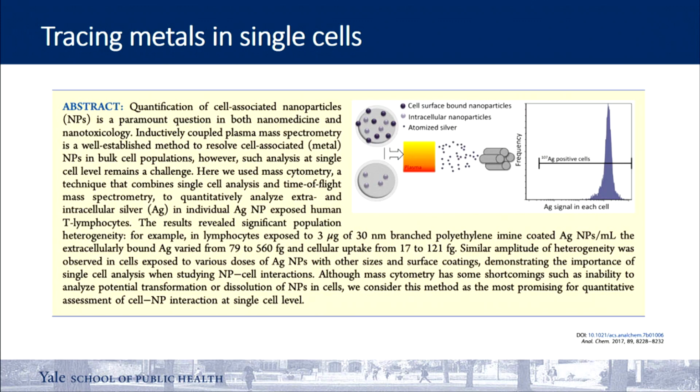So what I'm trying to tell you here is, based on this, if you can use a combination of this technology, you can monitor metals such as lead or other compounds, and at the same time on these single cells you can get either the metabolome or the proteomics, you can get a better sense of the mechanism and how it is going to be affected.